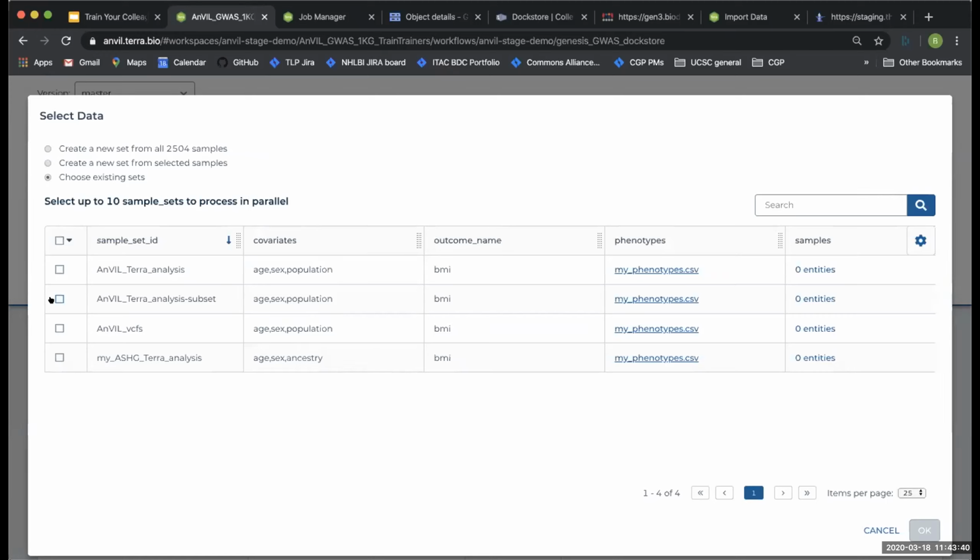Yeah, it's really the terminology around sets that's a little confusing. The first one is really saying select the table that you're going to pull from. Oh yeah, I wrote sample set to call this. Maybe that's the confusing part here: I'm calling it sample set.